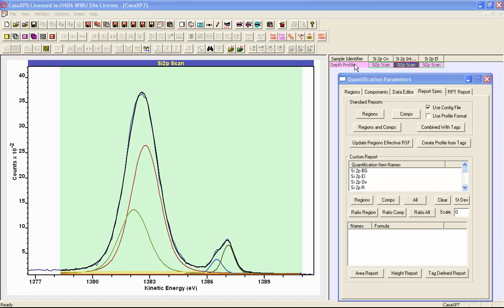So I've now prepared all of these spectra with the appropriate names in the components in order to do a Hill calculation. And to see the names that are available to me, I'll select all of these VAMAS blocks, and then we can see there's a background, we don't want that.